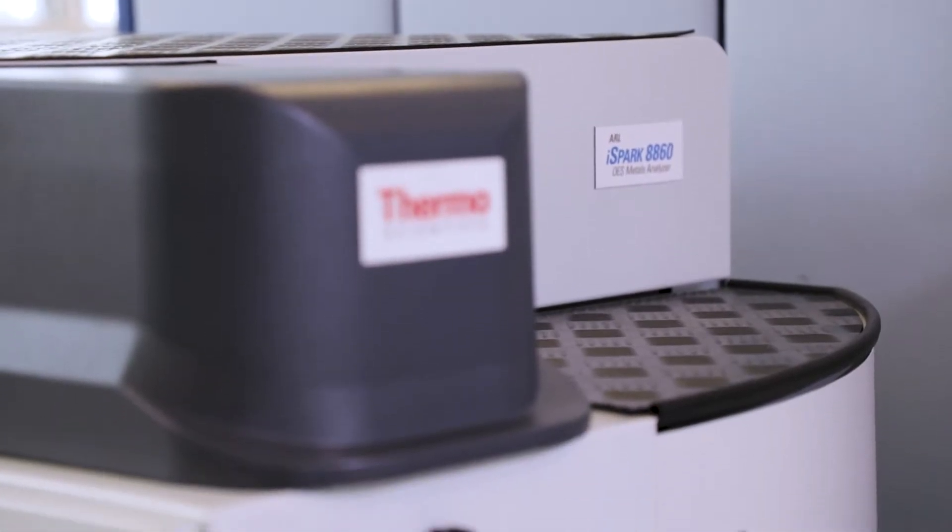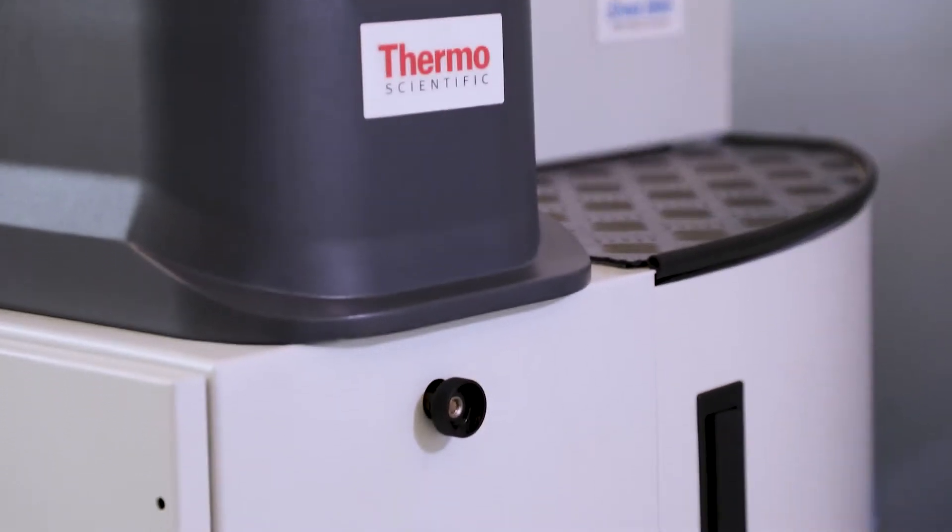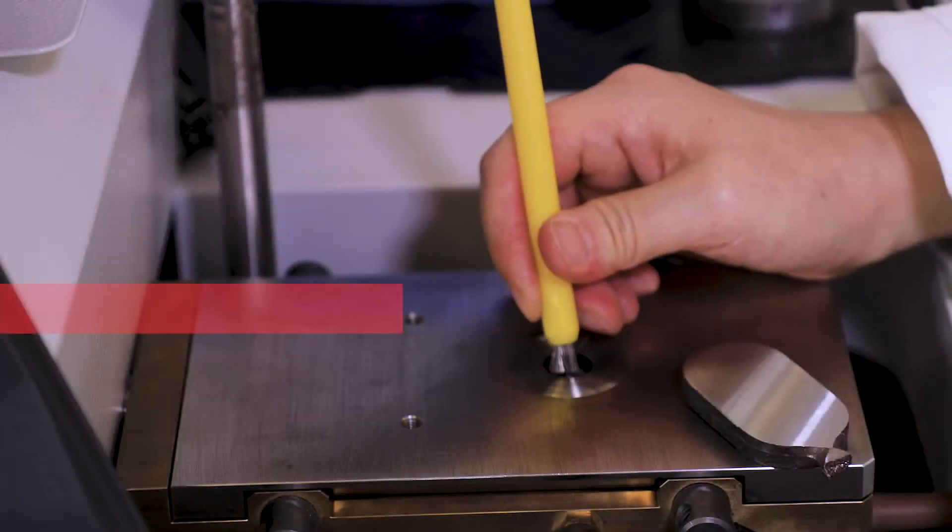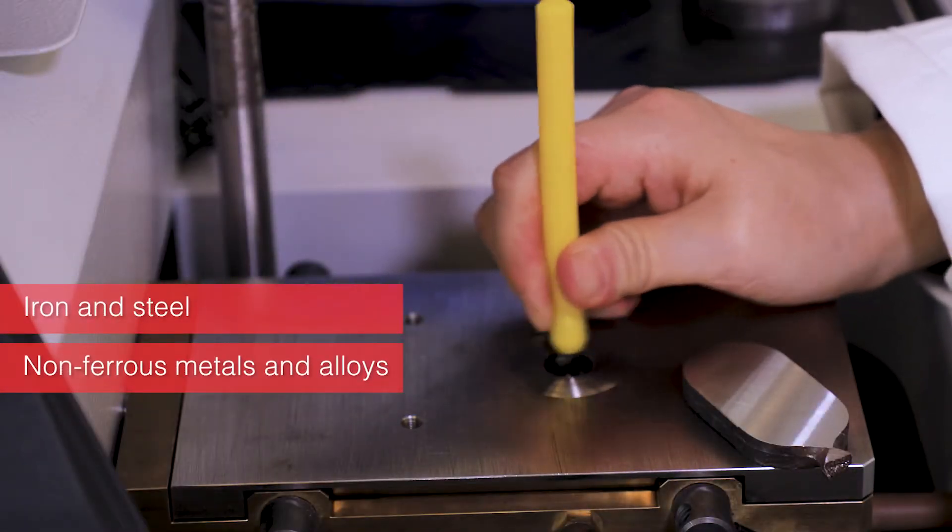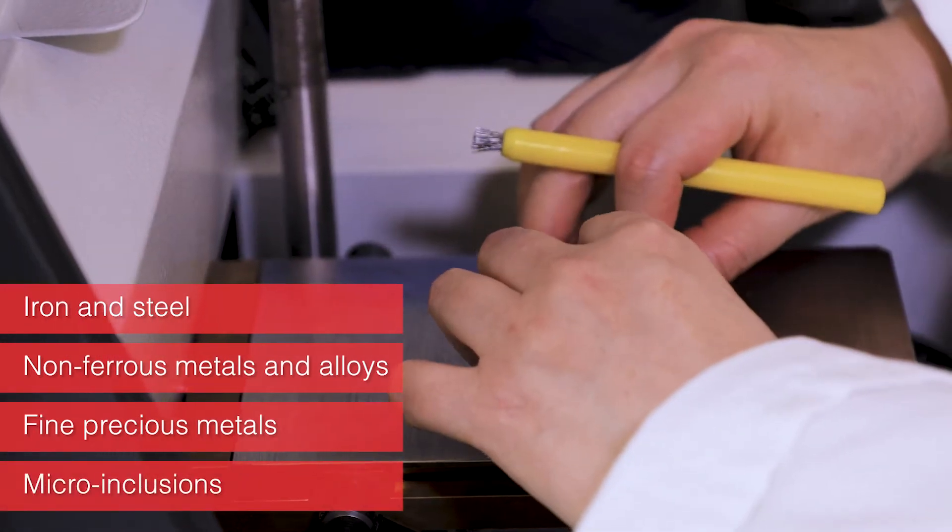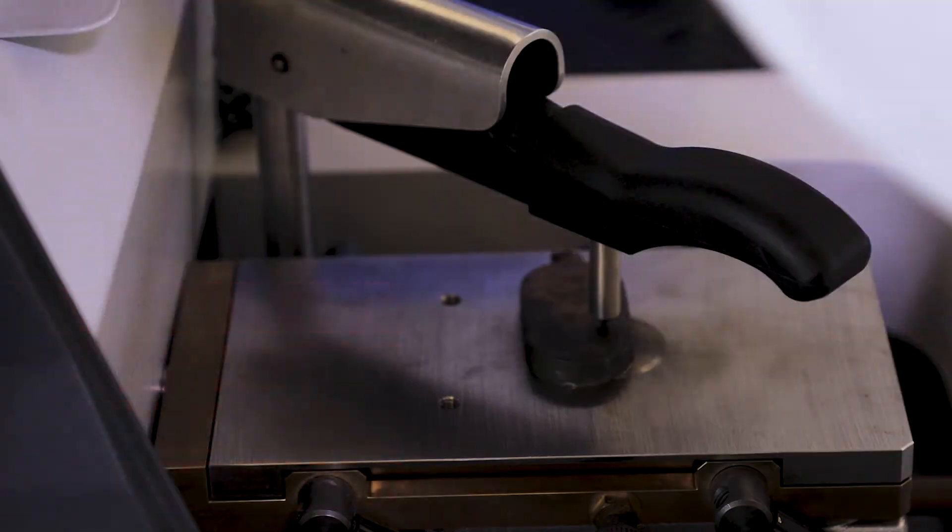The ARL iSpark Metals Analyzer is the answer to all your analytical needs, whether for incoming material or metal quality control and production analysis. It can analyze all the elements necessary in your current and future applications, delivering reliable performance 24-7, year after year.